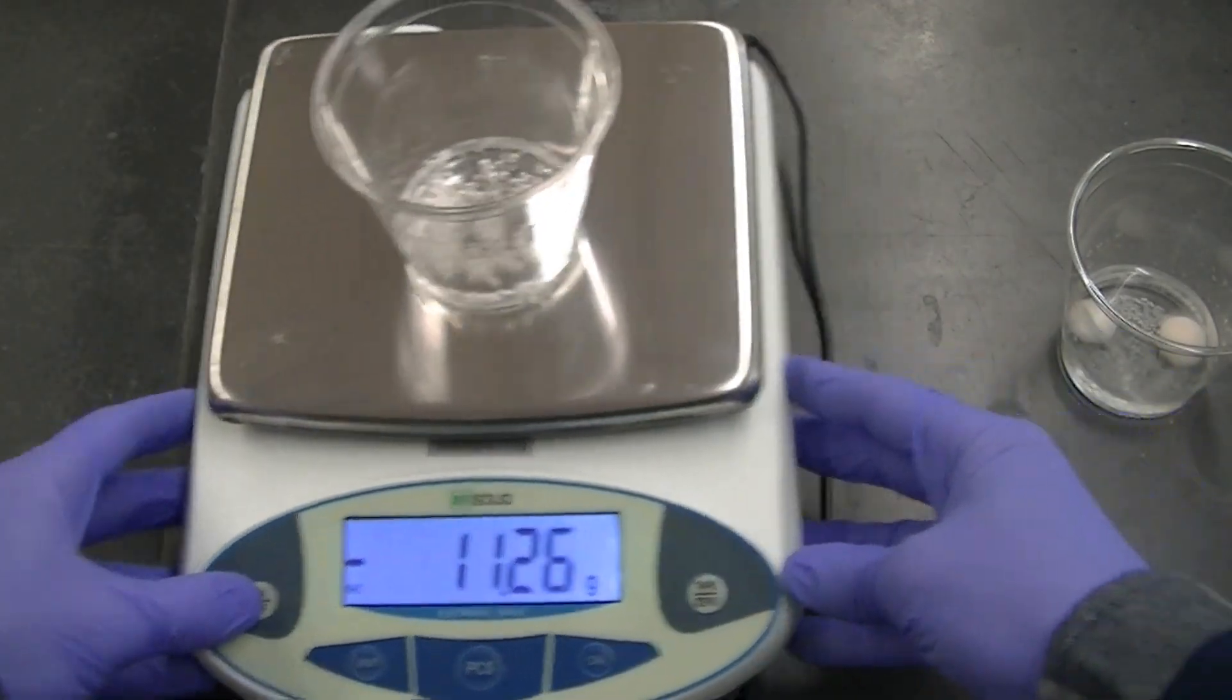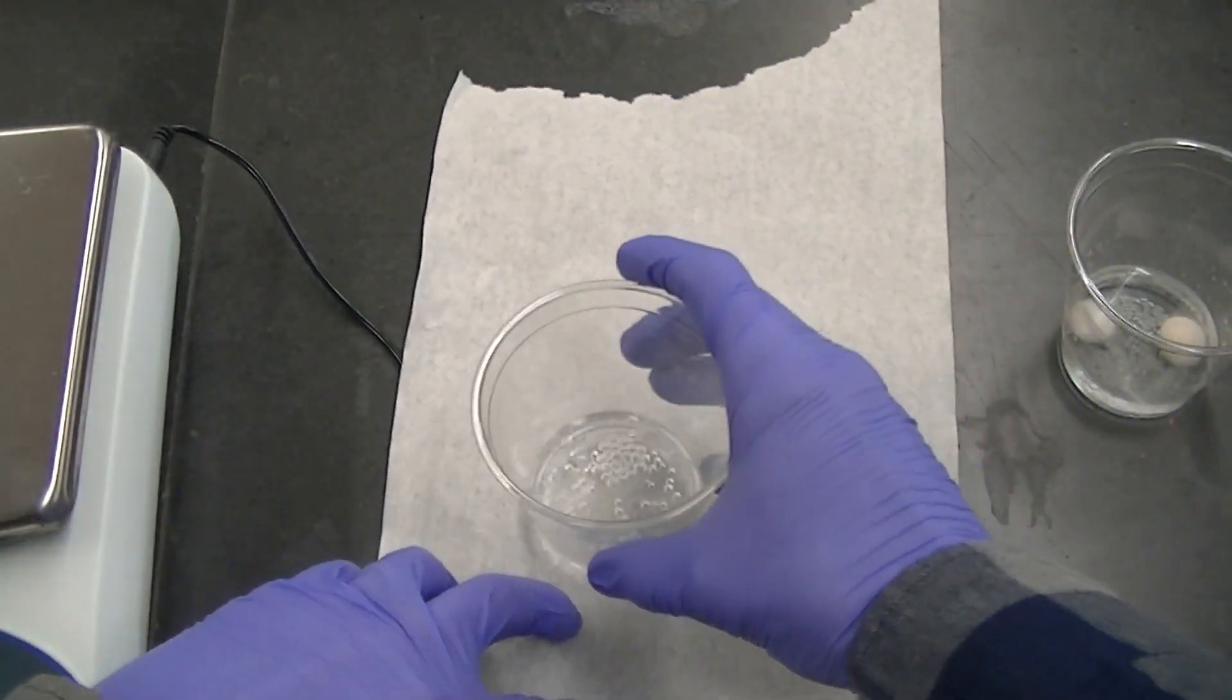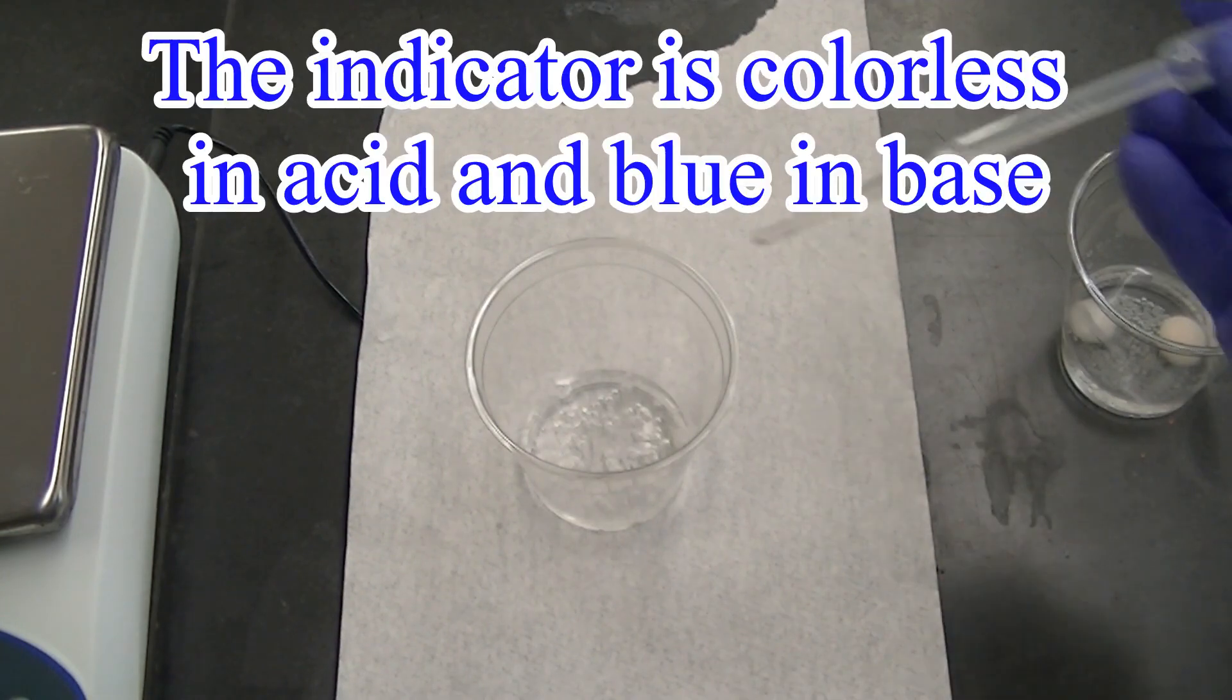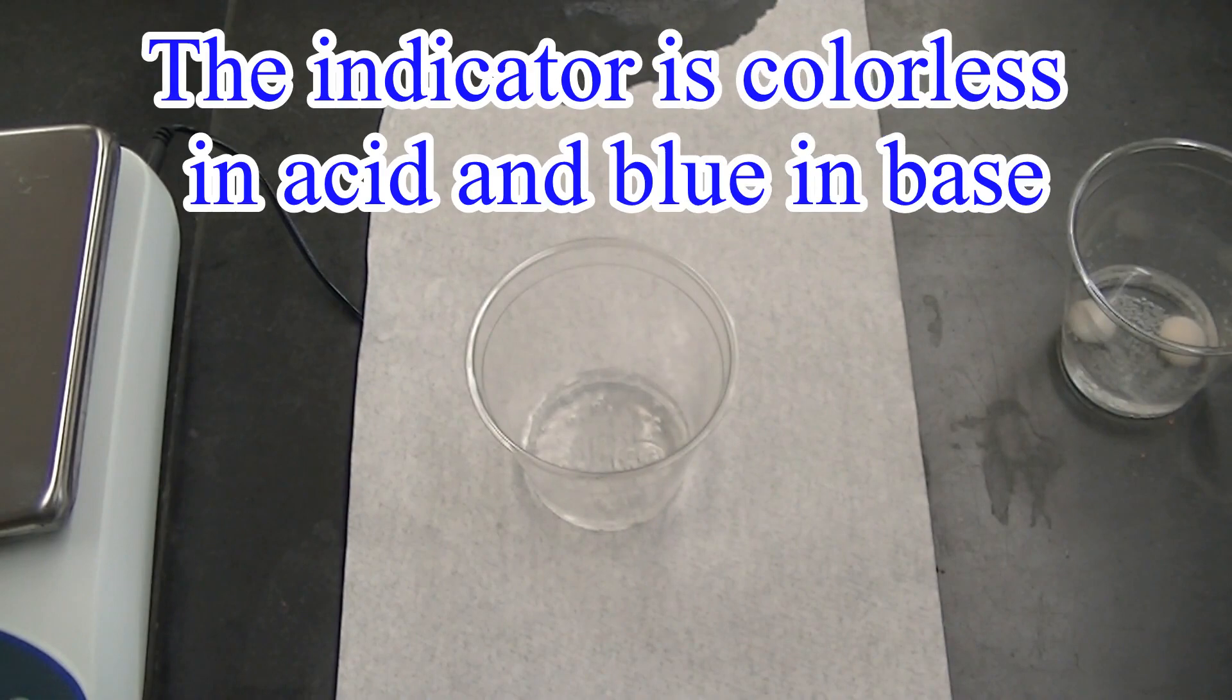Now we'll take our fresh sample of the diet 7up and we'll add a little bit of indicator to it. This indicator is colorless in acid and it's blue in base.